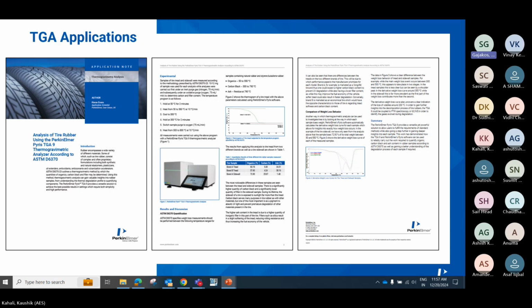of switching between the gases. We mostly work with the inert gas, nitrogen, and sometimes in the polymer industry, the polymers contain carbon, like rubber, or it can be coal, which contains carbon. So we need to understand the carbon content of the sample also. But to understand the carbon content, we have to oxidize that sample, and we require oxygen gas there.